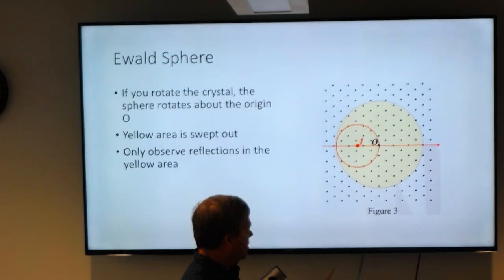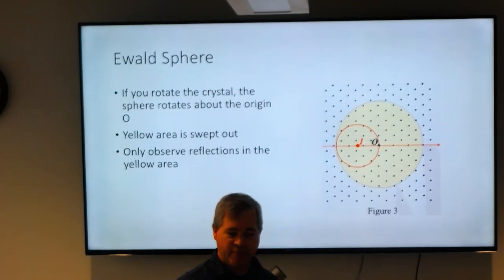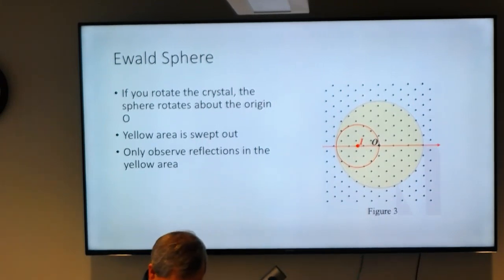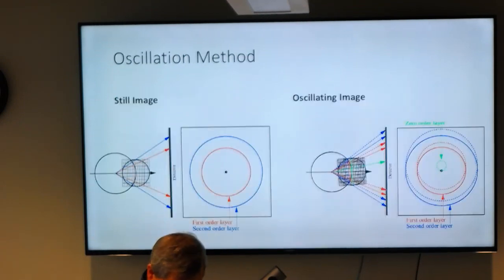And the main thing that you collect in diffraction is the intensities. So you have to have, at the very least, a very good measure of the intensities of the diffraction pattern, because some spots will be more intense than others.